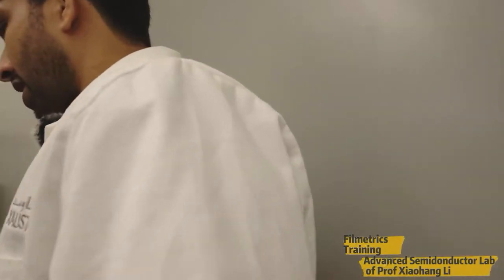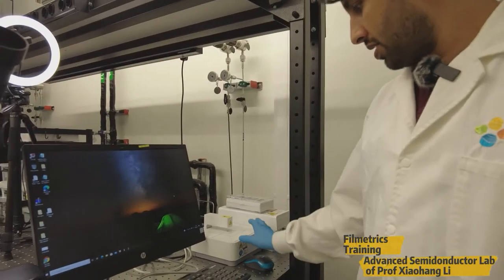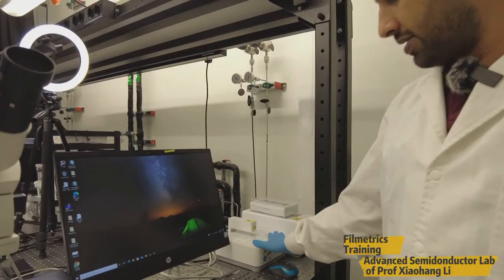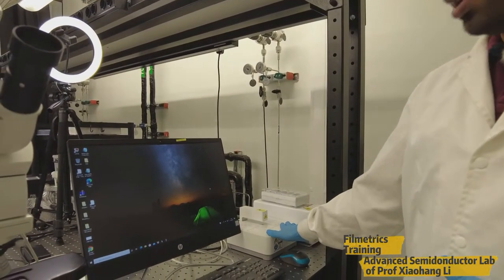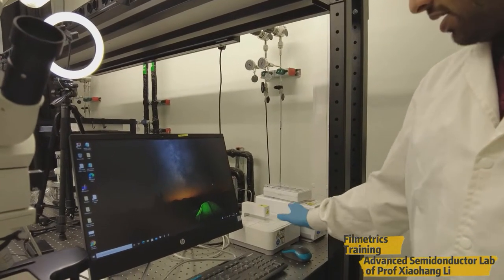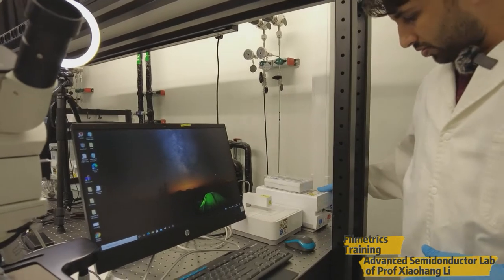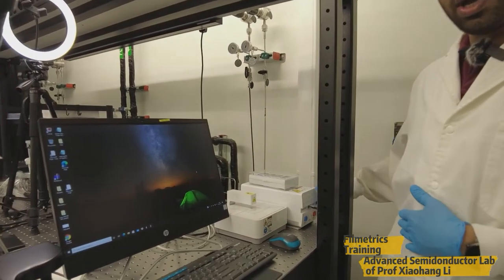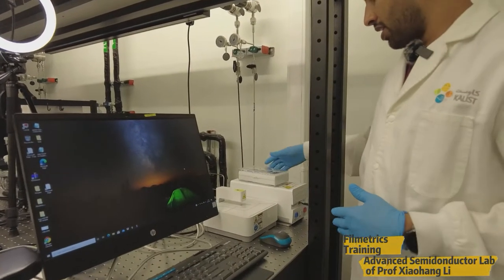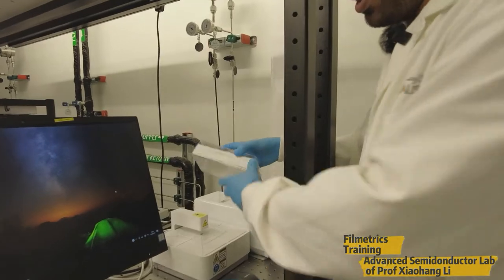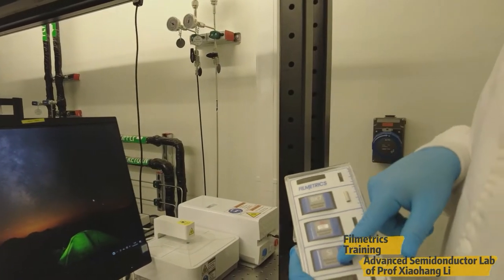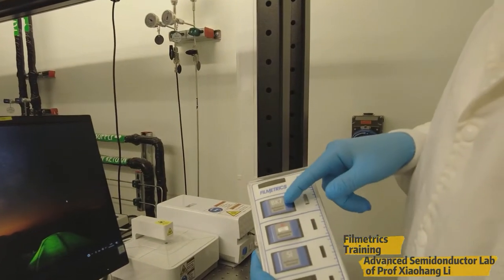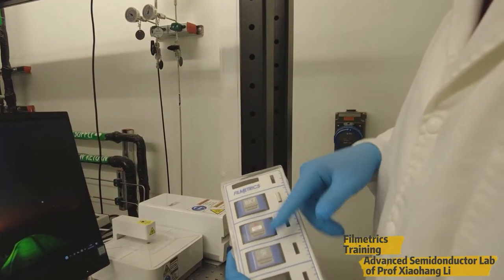So let me show you the hardware part. This is the sensor for detecting the reflectance and this is the light source, which includes deuterium and tungsten lamp. And these are the standard reflectance samples in order to calibrate the system.